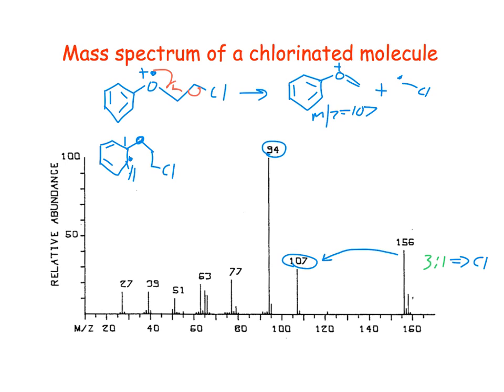So if we ionize that like this, then we can transfer a hydrogen atom over to the ring. So we have a radical there, 2 hydrogens on this side, and the plus. And then we finish this kind of McLafferty cleavage like that.